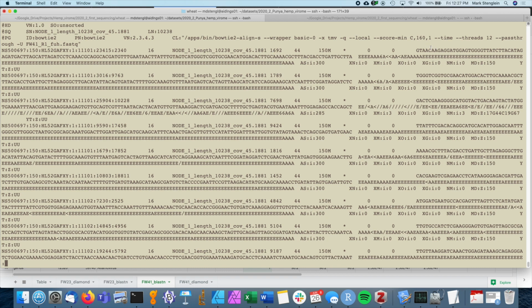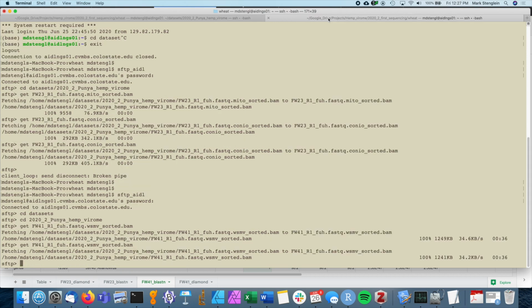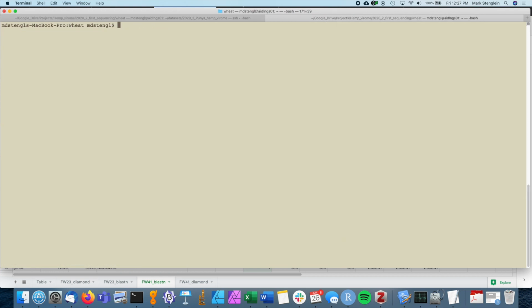And this is the read. This is the quality of the read. There's a lot of other information in this, but let's just give you an idea what that looks like. One nice thing about the SAM file is you can drag and drop that into Geneious and look at the aligned reads, which is a very useful step for validating, in a situation like this, your draft virus genome sequence.